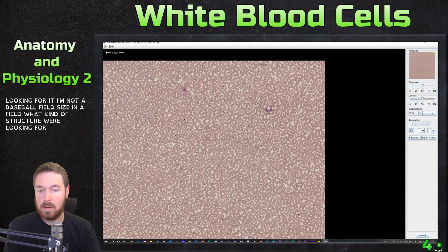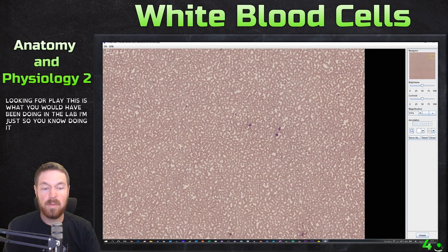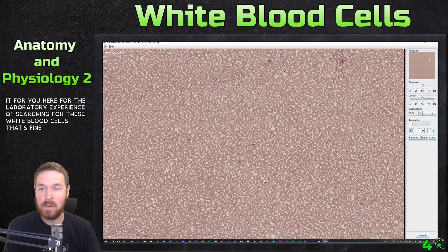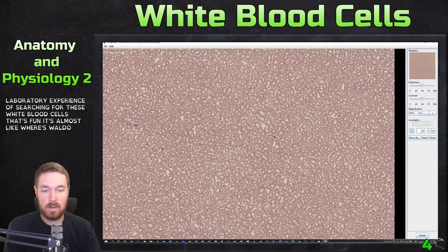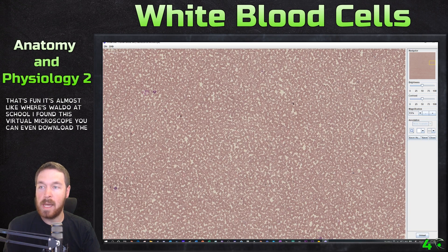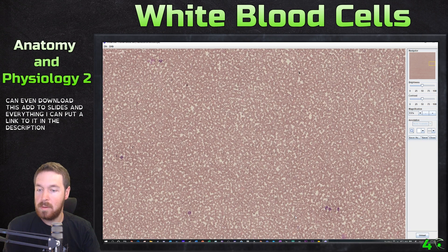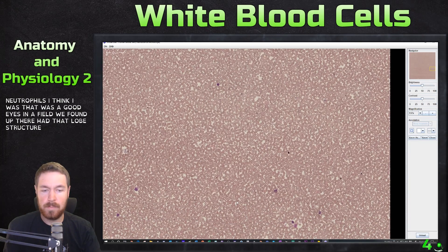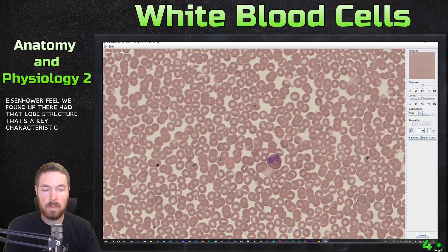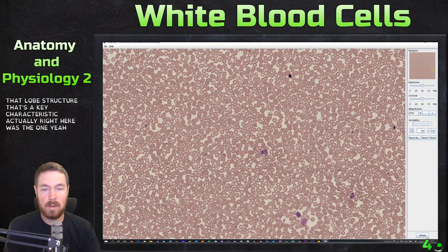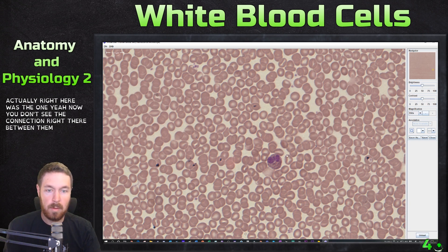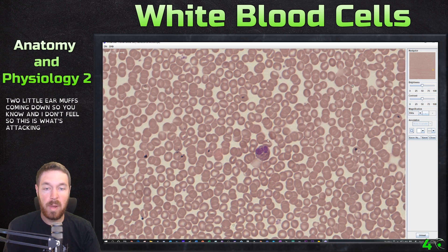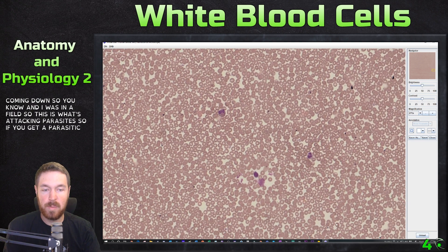This is what you would be doing in the laboratory — searching for these white blood cells. It's almost like Where's Waldo. Actually, right here is a good eosinophil — you can see two little earmuffs coming down. Even though the connection between the lobes isn't obvious, this is a good example. This is the eosinophil, which attacks parasites; if you get a parasitic infection, it would respond to that.